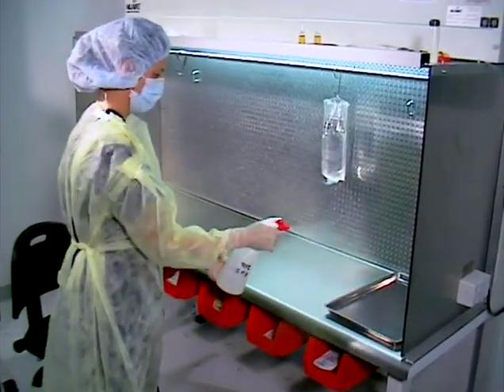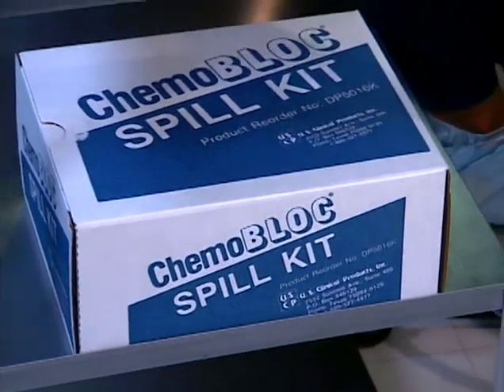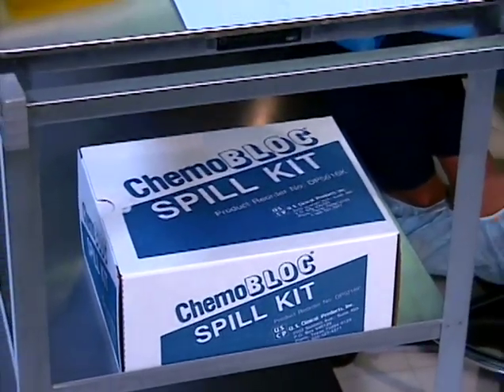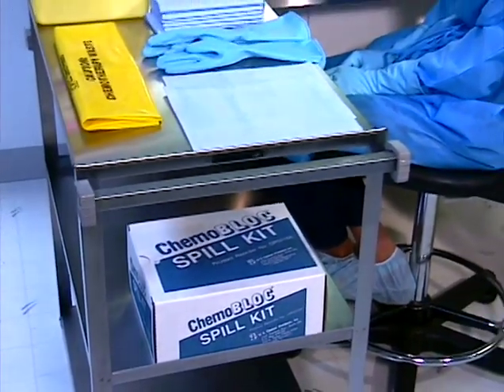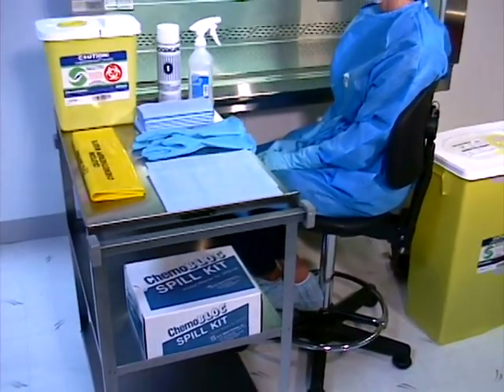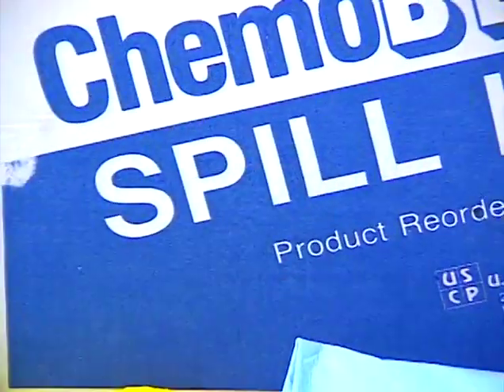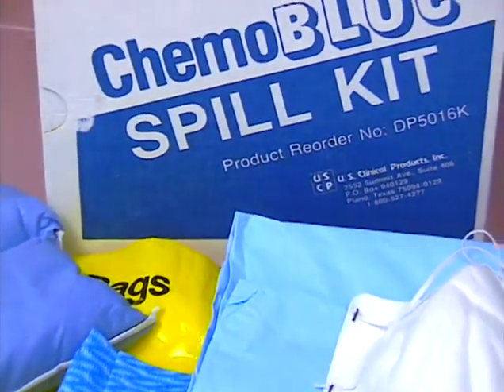Cleaning a BSC in which hazardous materials are handled requires special gowning and disposal of cleaning materials as hazardous waste. Prior to commencing work, be sure a spill kit is immediately available to the operator. Copies of the spill and exposure policies and all necessary material safety data sheets should be reviewed and completely understood by the operator prior to compounding activities.